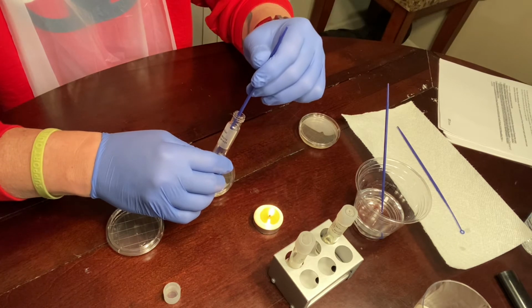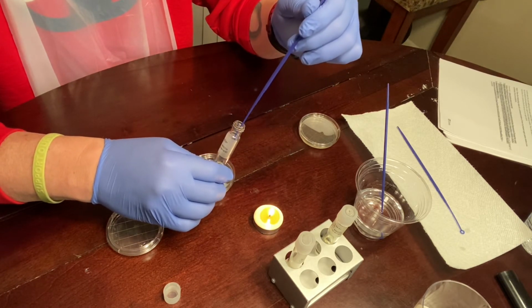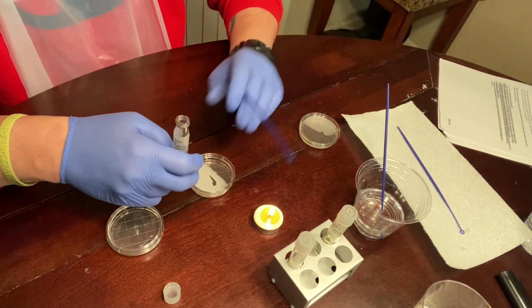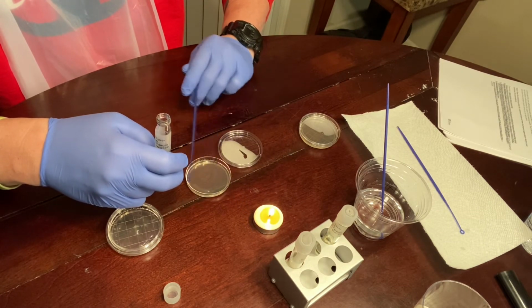Careful not to touch the rim. And I'm going to zigzag here.